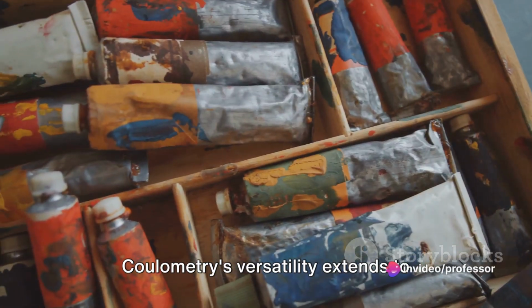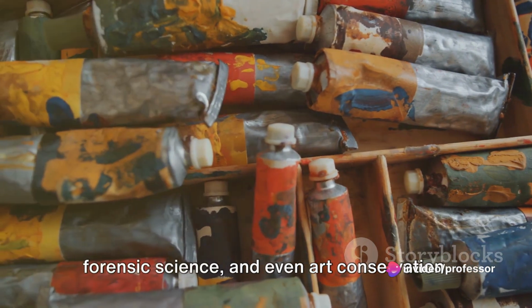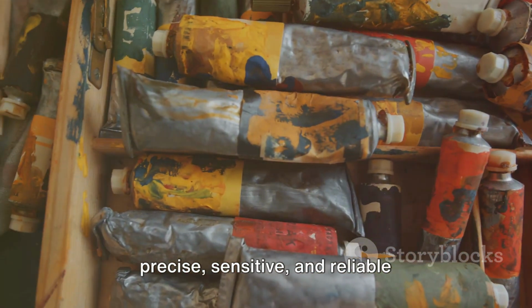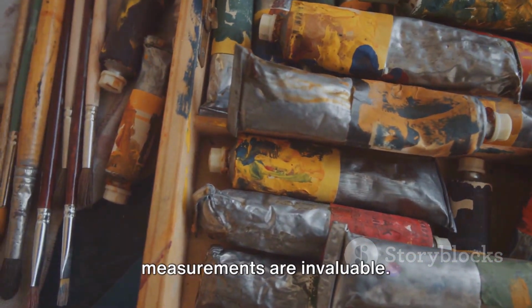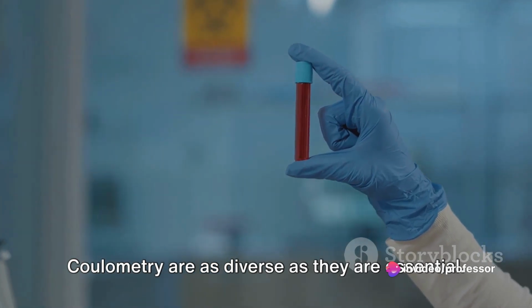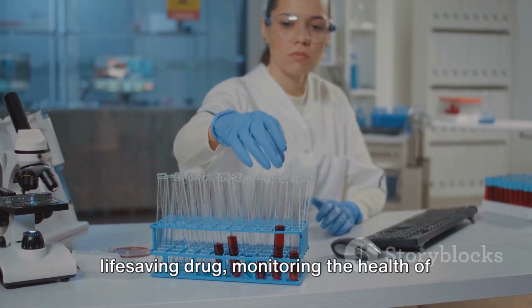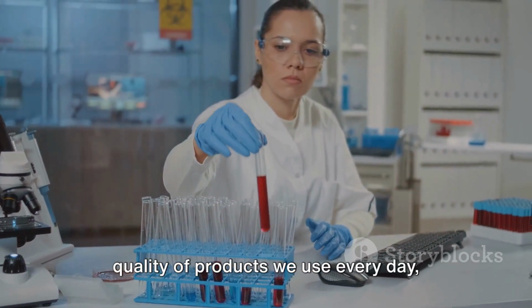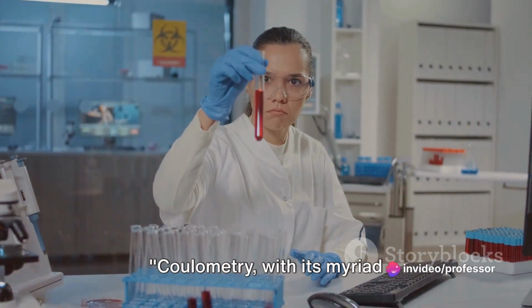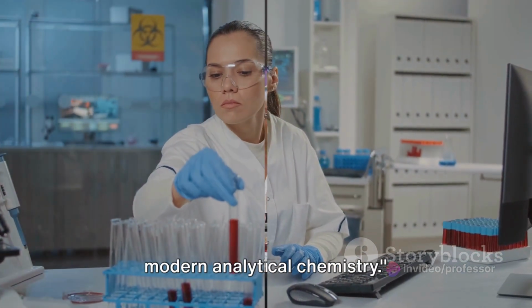But that's not all. Coulometry's versatility extends to fields like food and beverage testing, forensic science, and even art conservation. In each of these areas, coulometry's precise, sensitive, and reliable measurements are invaluable. In conclusion, the applications of coulometry are as diverse as they are essential. Whether it's ensuring the efficacy of a life-saving drug, monitoring the health of our environment, or guaranteeing the quality of products we use every day, coulometry plays a pivotal role. Coulometry, with its myriad applications, truly is a cornerstone of modern analytical chemistry.